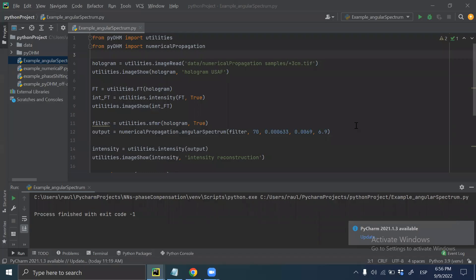Hello everybody! Welcome to this new video about how to use PyDHM to obtain the numerical reconstruction of holograms. In this opportunity, I want to show you how to use the angular spectrum approach to obtain the reconstruction of a hologram recorded in off-axis architecture.